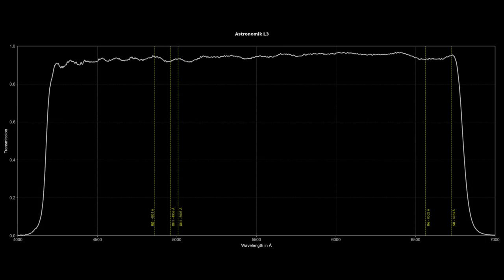So I measured two specimens of the Astronomic L3 filter, and I obtained very similar results in both cases. The bandpass starts around 415 nanometers, so it's not that far off from the manufacturer's specs, and the average transmission is between 90 and 95 percent, depending on the wavelength. This is a great filter to own if, like me, you have a budget refractor.